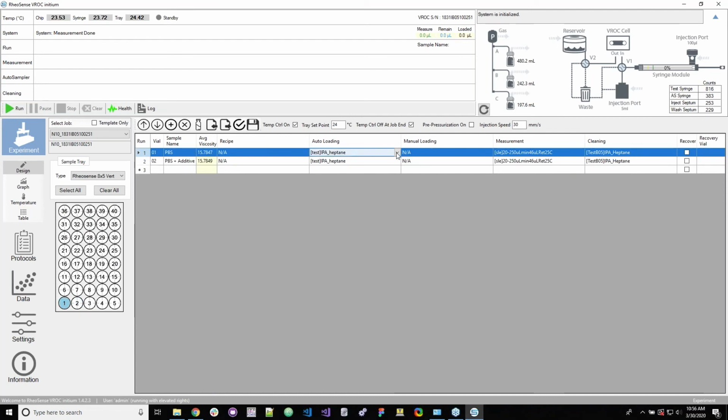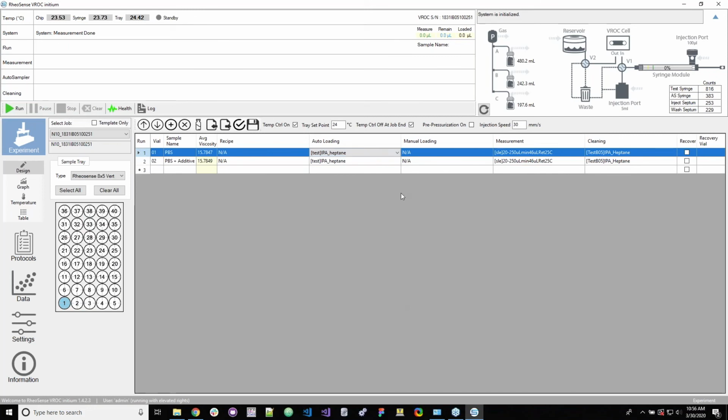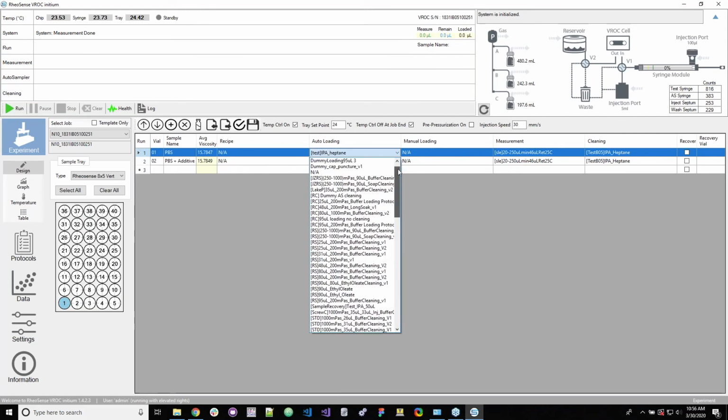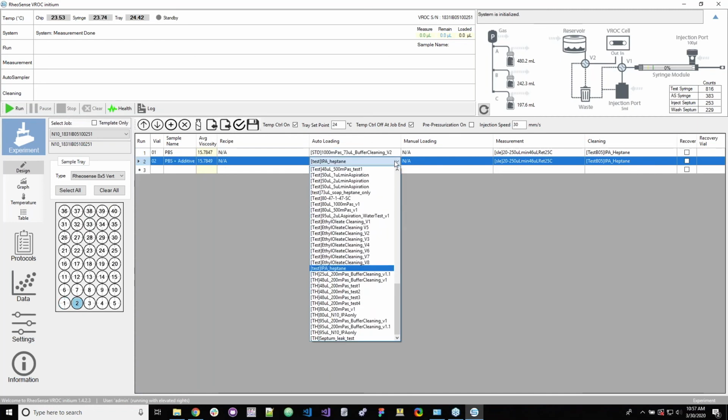And then I'm going to select the loading protocol. And so now, since this is a protein, we want to use our buffer cleaning loading protocol. So here we have our standard buffer cleaning protocol. So I'm going to select that here. And then I want to also select that here.